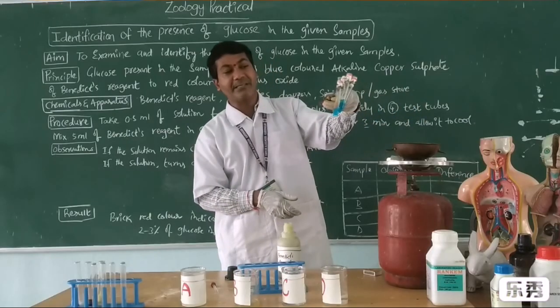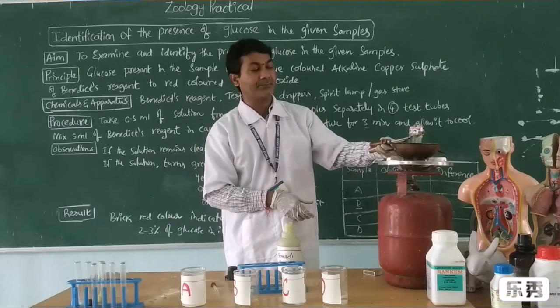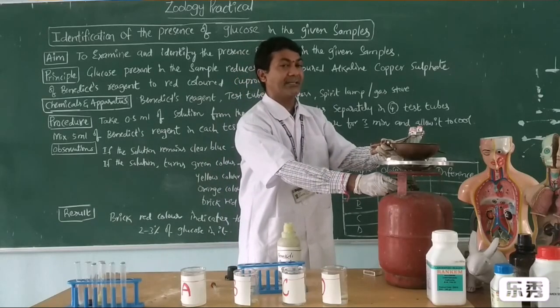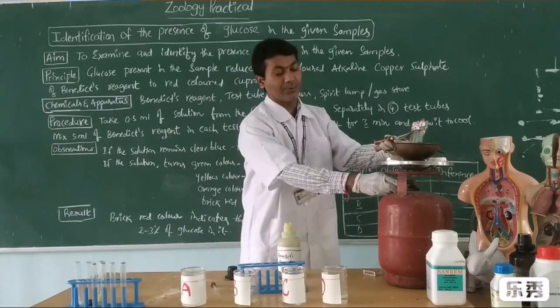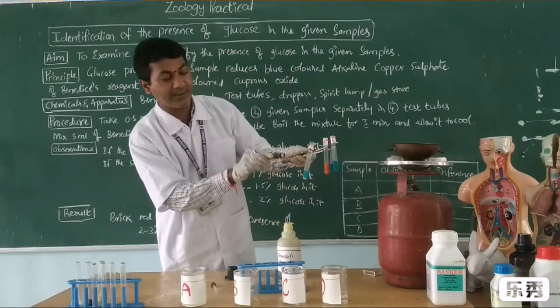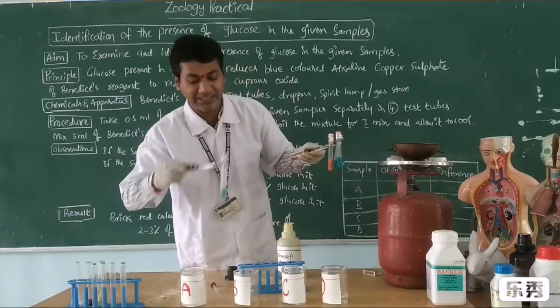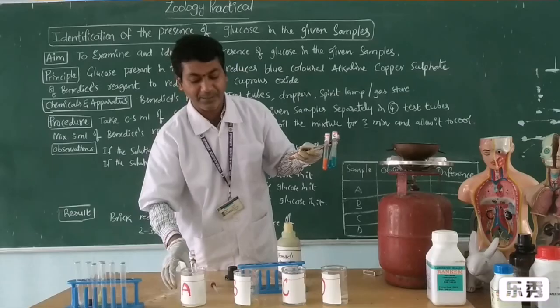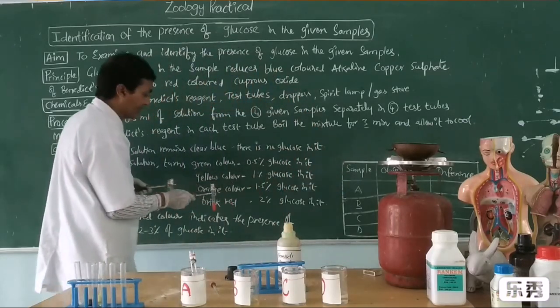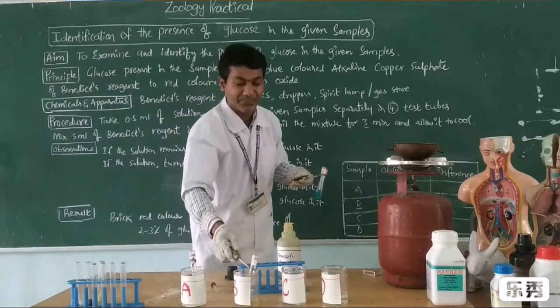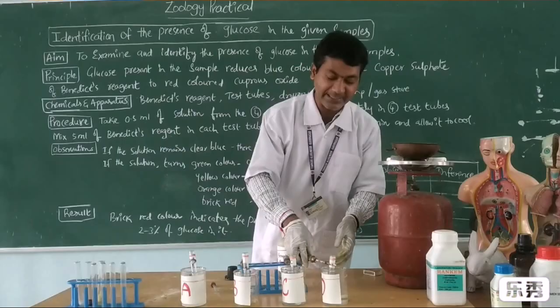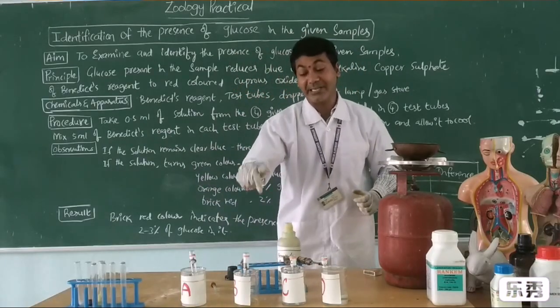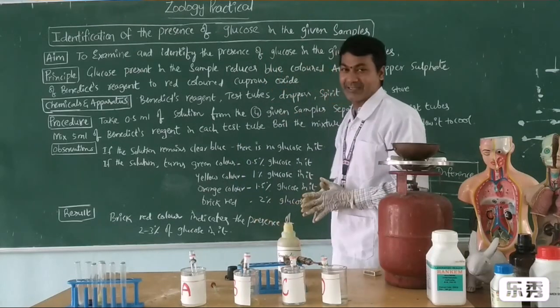3 test tubes remain the same blue color, and one has turned into red. Because I heated with more heat, it turned very quickly. Looking at all 4 test tubes: test tube A remains blue — no glucose found. Test tube B turns into red color — contains glucose. Test tube C and test tube D remain the same blue color. By this, we can understand that test tube B contains glucose, specifically 2 to 3% of glucose.